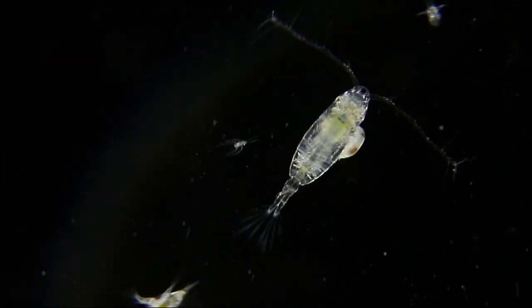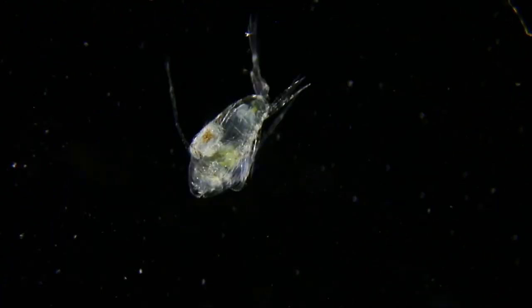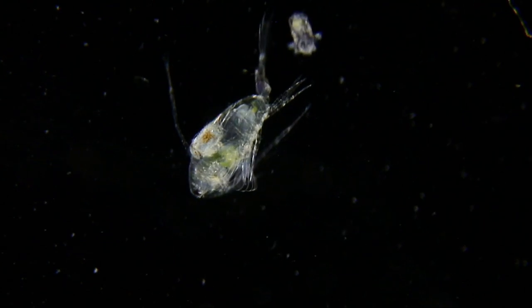Like a large tick. See what happened when I placed the microscope slide coverslip. And here it let go of the copepod.